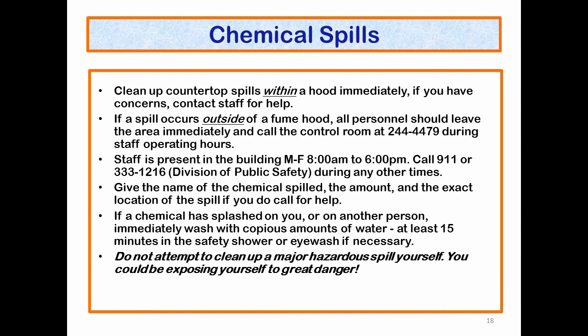Alternately, you can call 911 or 333-1216, the Division of Public Safety, during any other times. Give the name of the chemical spilled, the amount, and the exact location of the spill if you do call for help. If a chemical has been splashed on you or another person, immediately wash with copious amounts of water, 5 minutes for hydrofluoric acid, and at least 15 minutes in the safety shower for other chemicals, or eye wash for 15 minutes if you get it in your eyes.